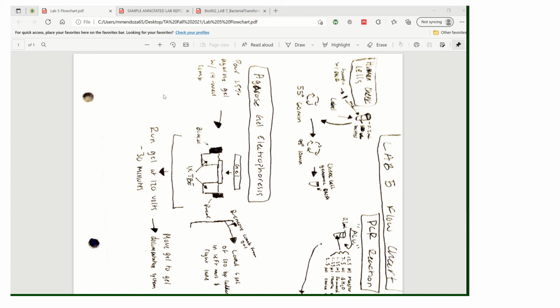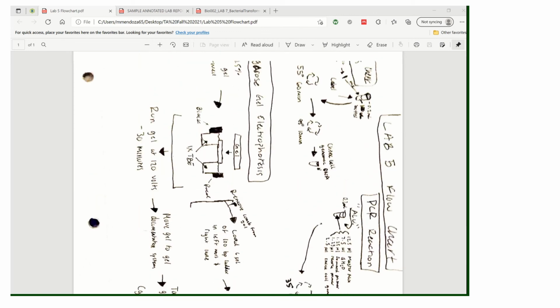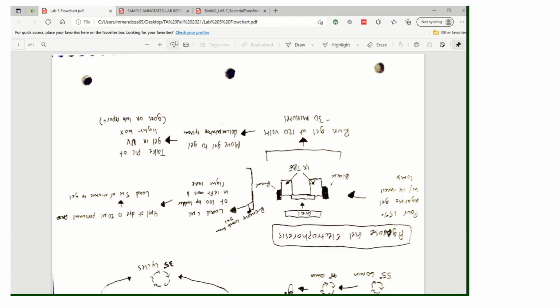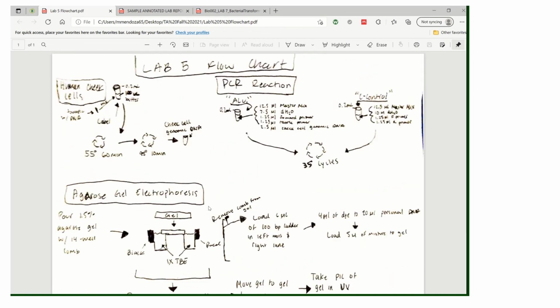So from now on, what I'm going to ask all of my students to do is draw out your flowchart. So use this example, okay? You can draw your little things and then just annotate. You see how they don't have all of the steps written step by step? Let me see, can I flip this over? Okay, so this is perfect. So try to model this, and this way you don't have any chance of plagiarism. There's zero chance of plagiarism if you draw it out and then just upload a picture.